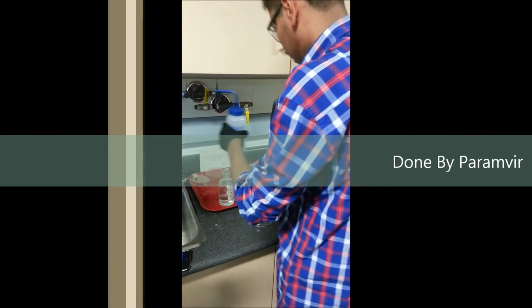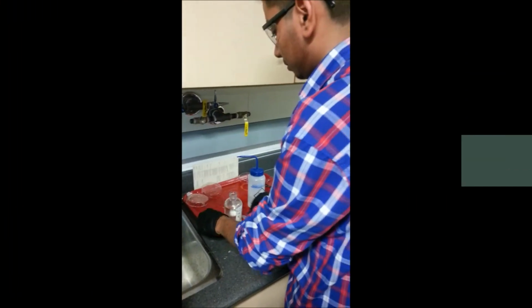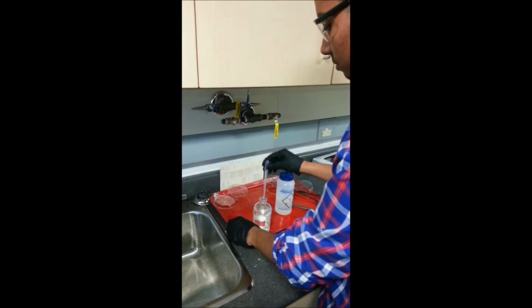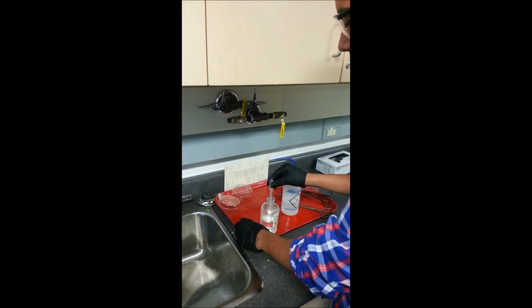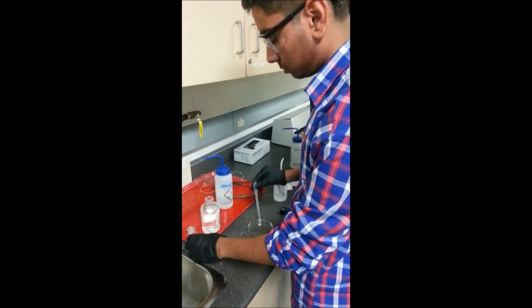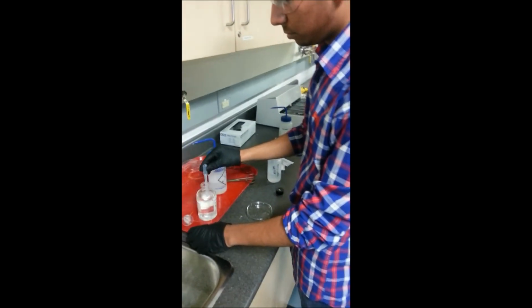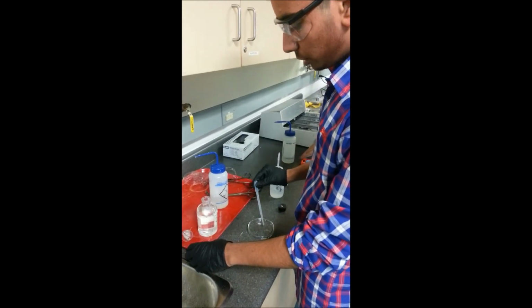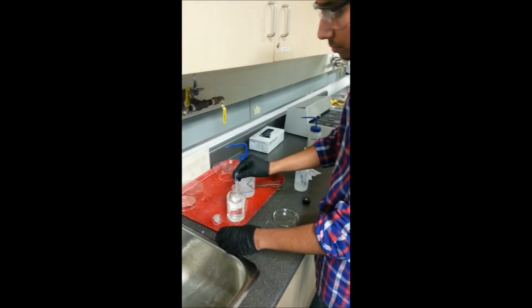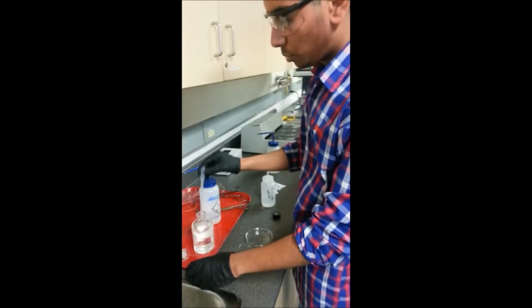For the etching process, we use a dropper to extract 2% nital solution and then mix it around the dish. And afterwards, when we have taken the sample, we take the metal and move it around the dish for about 45 seconds.